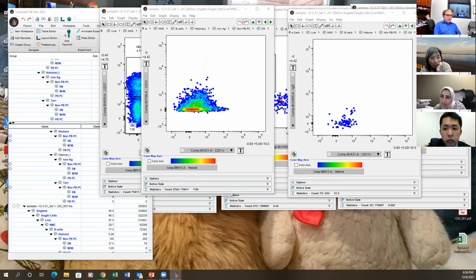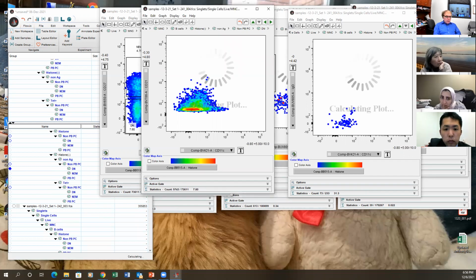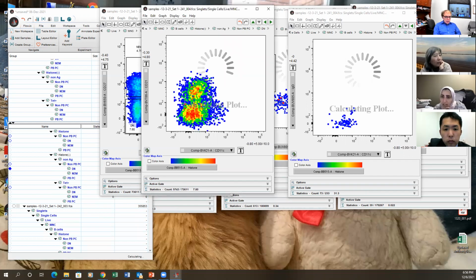But I'm convinced this is it. It works. We just have to get a few more B cells here, so we can batch them and do single. So next cell, this time I'm going to do the same. I will not change anything.